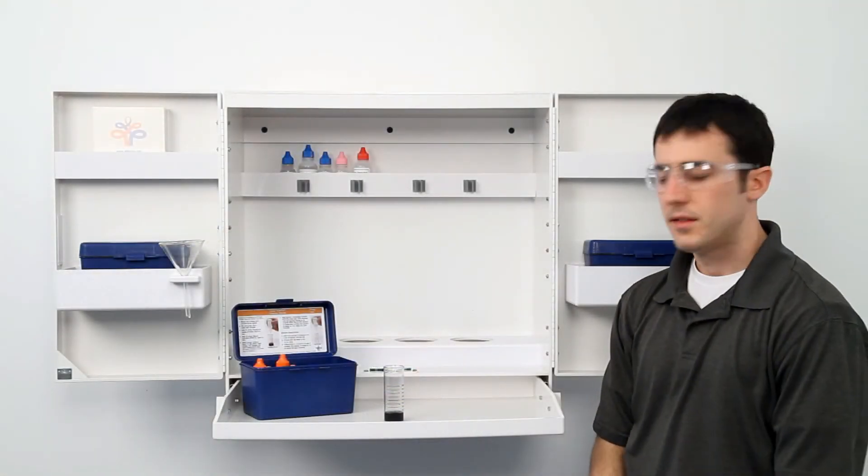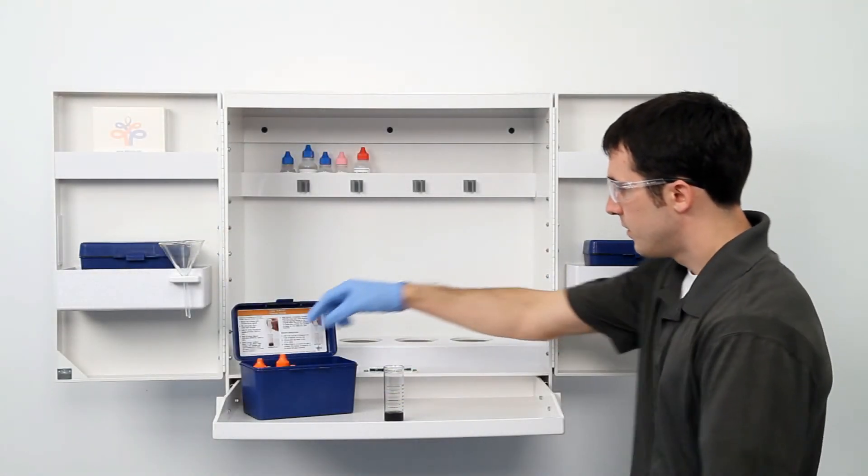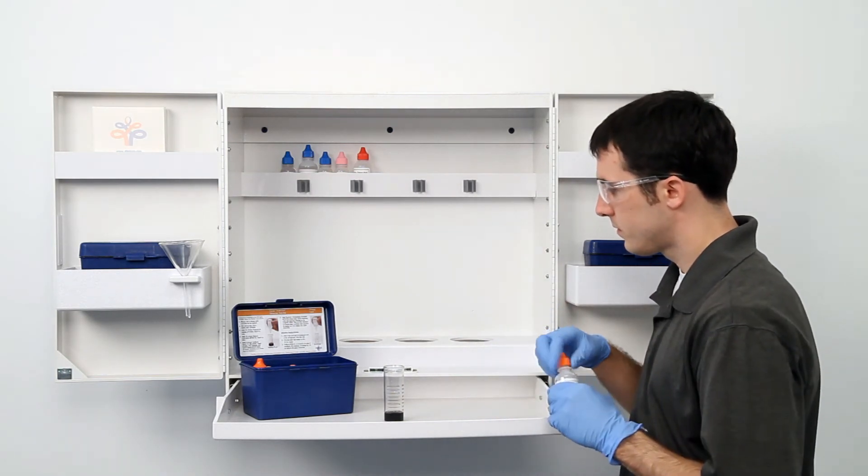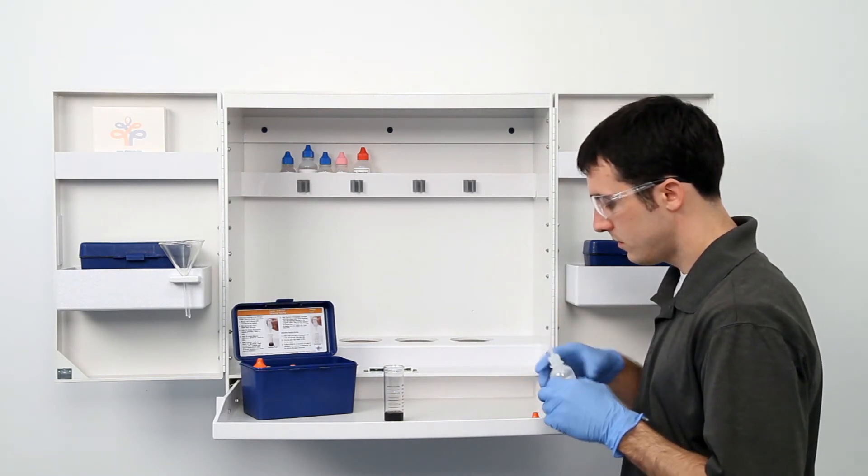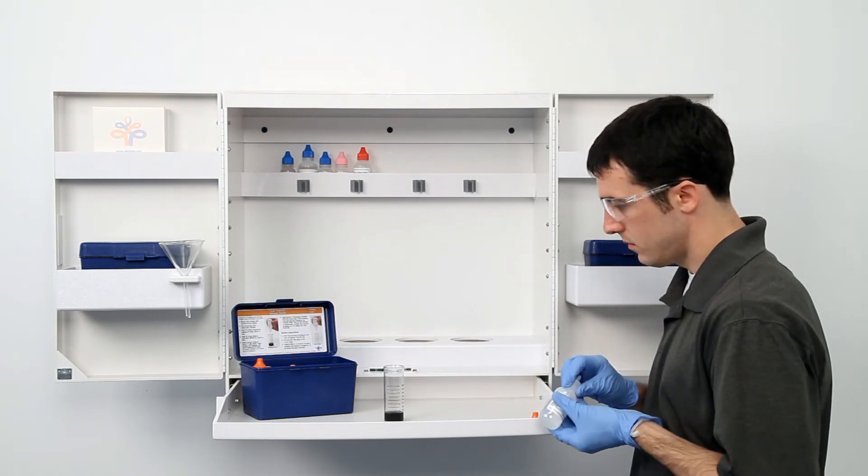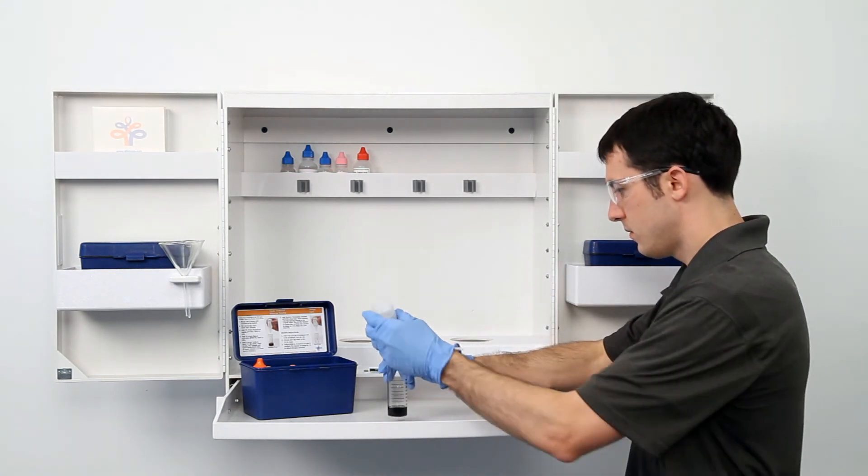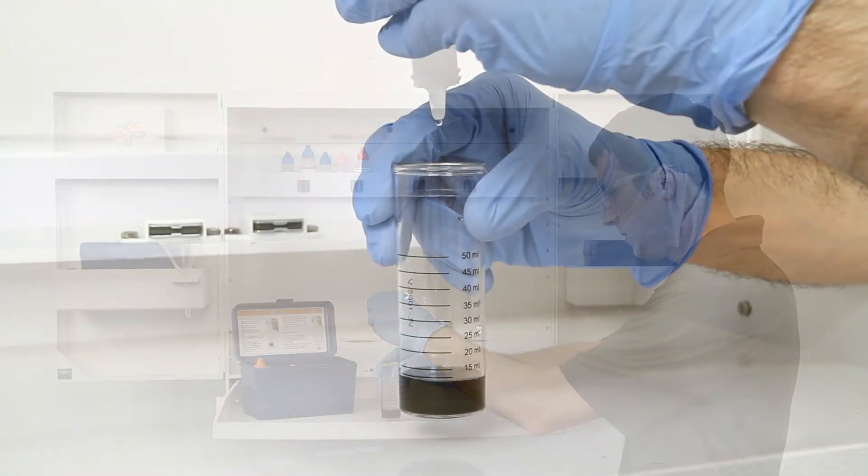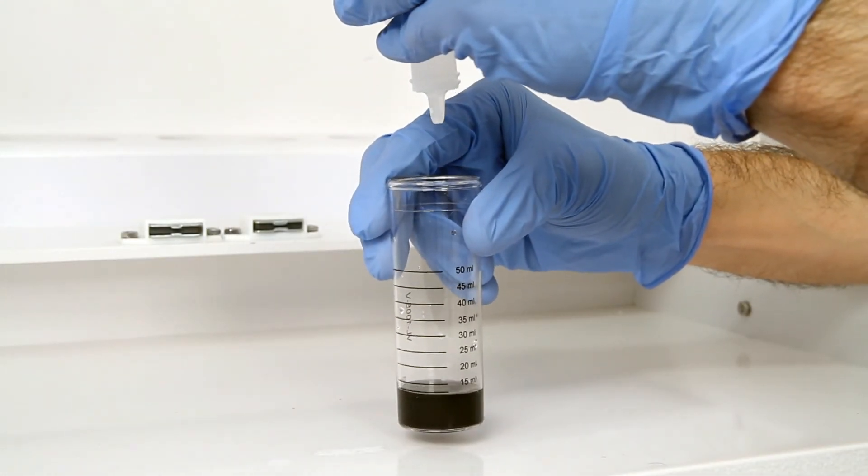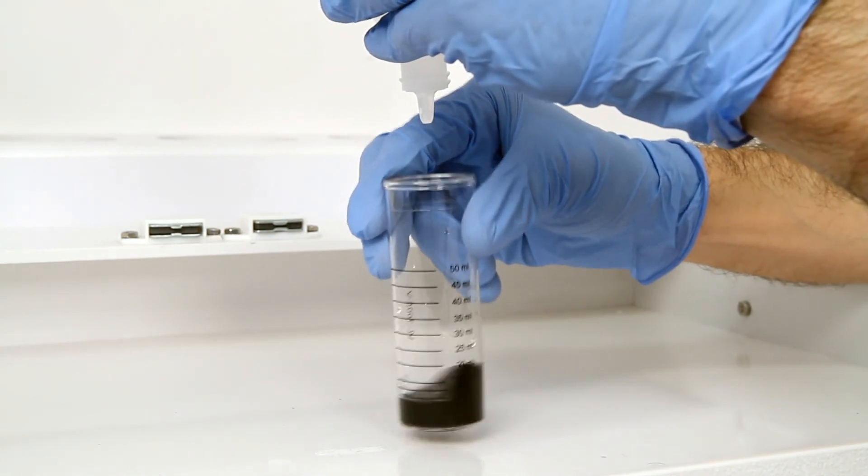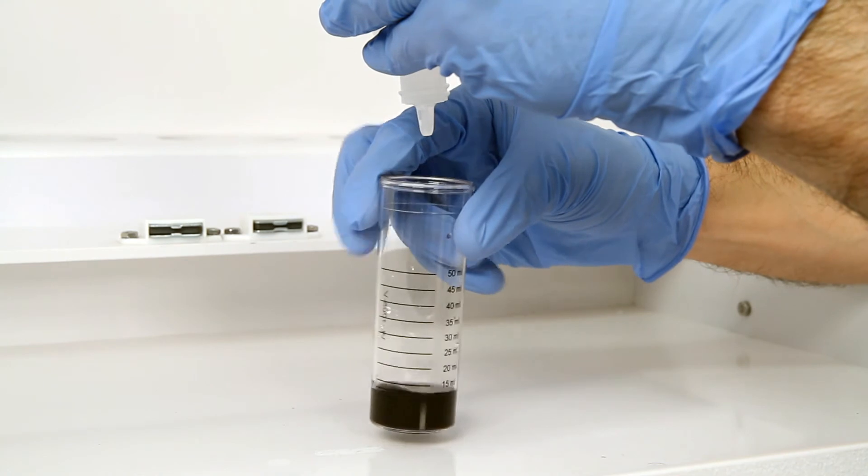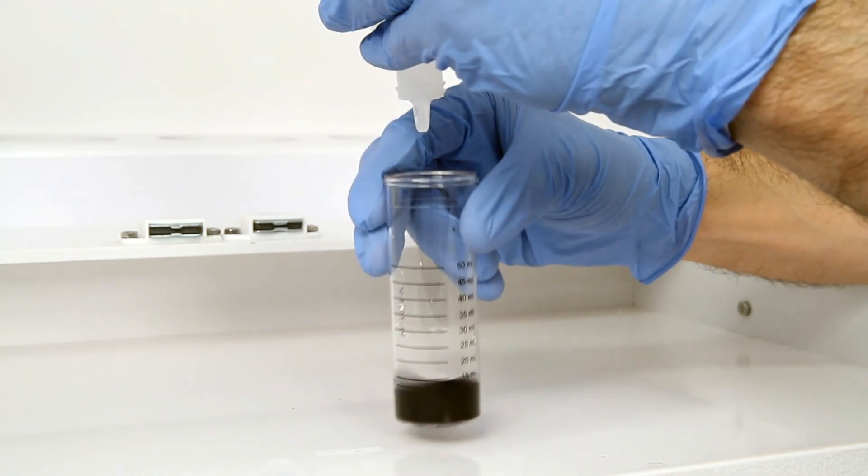The next step is to perform the titration. It's important to make sure you have the proper titrant and the proper sample size for this titration. You will use sodium thiosulfate titrant. The bottle contains a dropper tip, so it's important to hold the bottle vertically to make sure you get a consistent drop size. After the addition of each drop of titrant, swirl the vial to make sure the sample is properly mixed. Count the number of drops during this step.